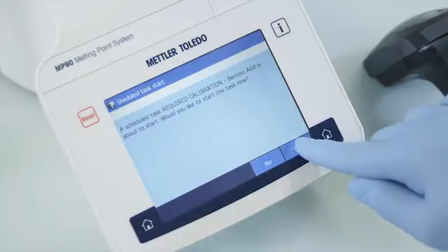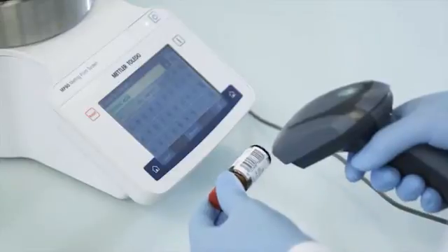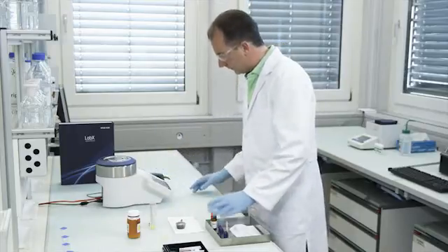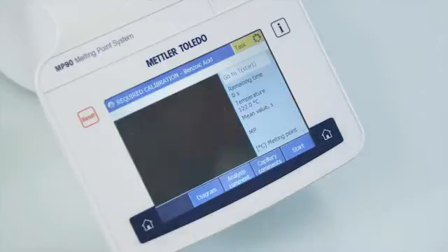Using the barcode reader to register the substance lot number avoids any transcription errors. Thanks to this software, all data is automatically stored on the system.